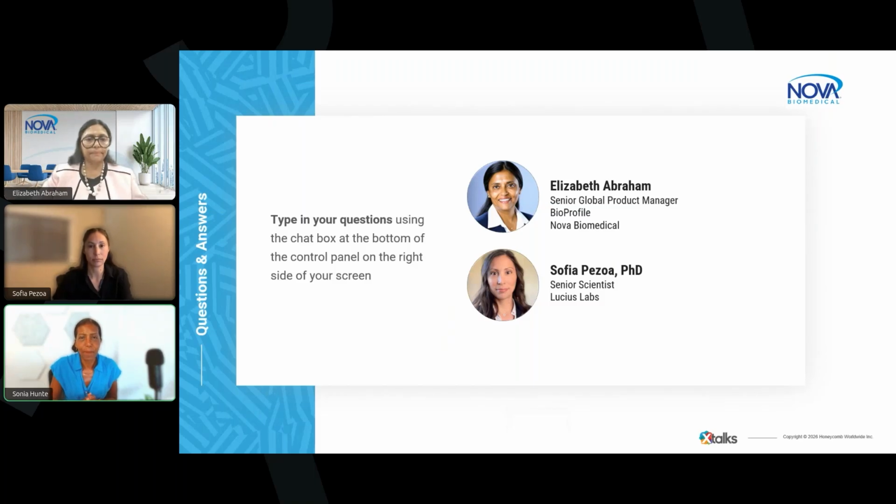This audience member is asking, what are the biggest bottlenecks you encounter when collecting viable cell density data during development, and how can automation help address them? Great question. What are your thoughts on that one? Indeed, it is a great question. So the most common bottlenecks are manual sample dilution, inconsistent counting methods, limited throughput, and the time required to transfer and analyze the data. And automation helps by standardizing workflows, eliminating manual dilution and data entry, delivering faster, reproducible results. So this allows the researcher to make decisions that accelerate cell culture development and process optimization.